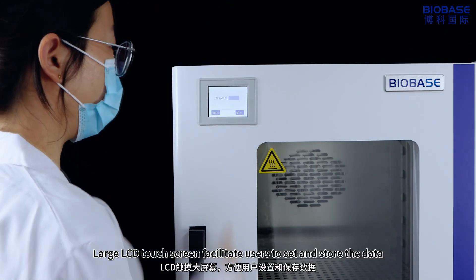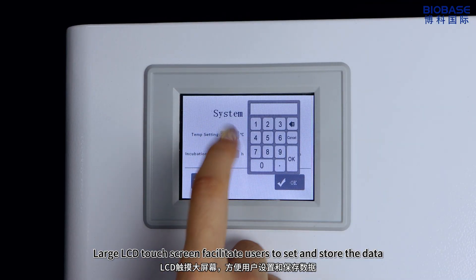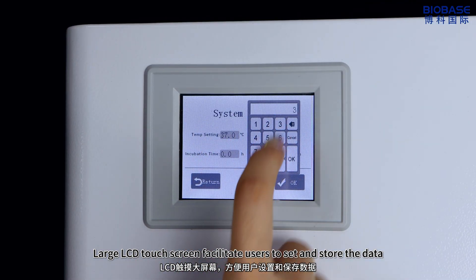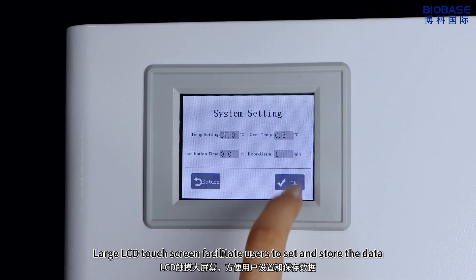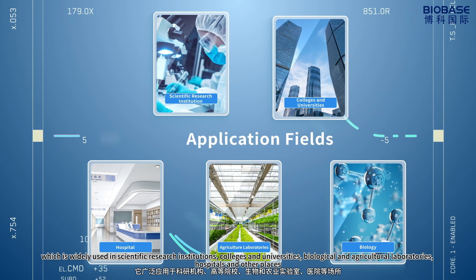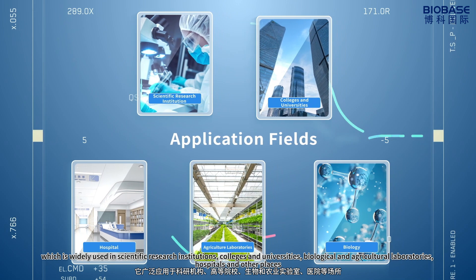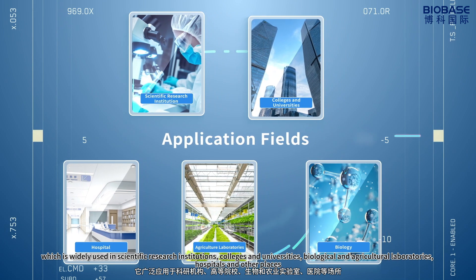A large LCD touchscreen facilitates users to set and store data. The incubator is widely used in scientific research institutions, colleges and universities, biological and agricultural laboratories, hospitals, and other places.